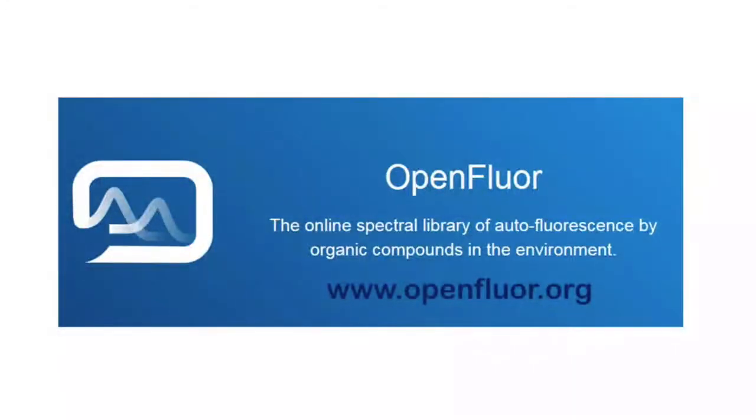This is a short introduction to the OpenFluor database. OpenFluor is a searchable online library of fluorescence spectra. At present, it contains two types of data. The first are fluorescence measurements of some pure organic compounds dissolved in water. The second are PARAFAC decompositions or PARAFAC models of natural organic matter fluorescence measurements in environmental samples.